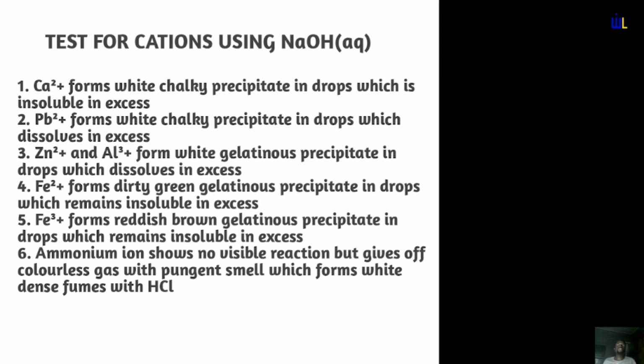Now, every ammonium salt reacts with a base to form salt, water, and ammonia gas. So just have that in mind, that whenever you introduce NaOH in an ammonium salt, you will not see any reaction, because the reaction with NaOH produces a soluble salt. You will not notice the formation of the salt, because the sodium salt that will be formed is soluble. That's why in number 6 you saw no visible reaction. It doesn't mean that there's no reaction, it's just that you can't see it with your eye.